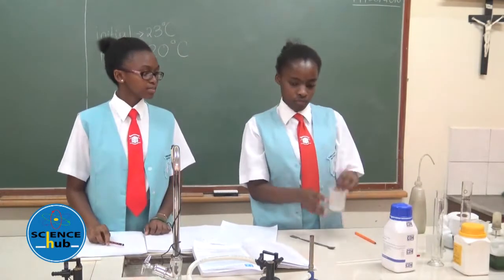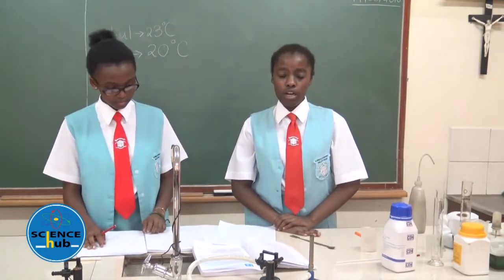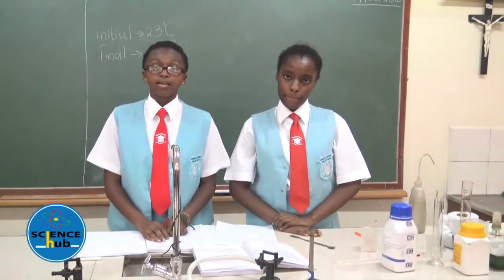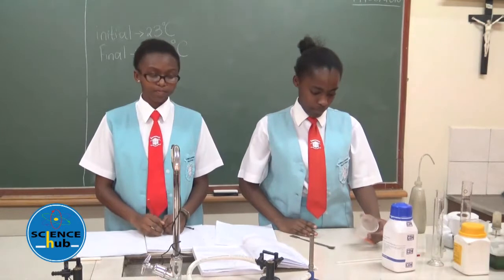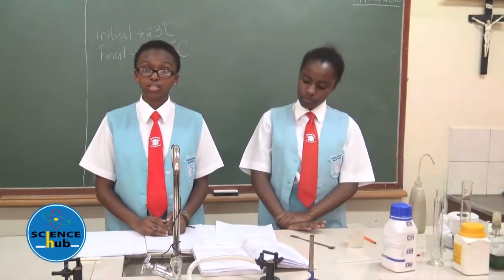What do we note? We note that the temperature lowers after you add ammonium nitrate to it. Yes, the temperature is lowered in an endothermic reaction. This is because heat energy is absorbed. Therefore, the reactants have more heat than the resulting solution.